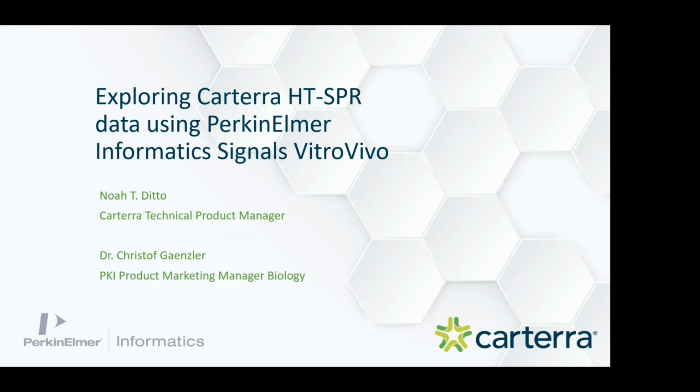As many of you know, data-rich technologies are a critical part of the drug discovery process, particularly platforms using artificial intelligence and machine learning. High-throughput surface plasmon resonance is truly an indispensable tool given the enormous amounts of data needed to make these processes robust. But with the vast quantities of data comes a real need for meaningful interpretation in real time and the ability to share amongst cross-functional teams. This talk is going to focus on the use of PerkinElmer's Signals VitroVivo software and its ability to integrate and display results from high-throughput SPR experiments using the Carterra LSA.